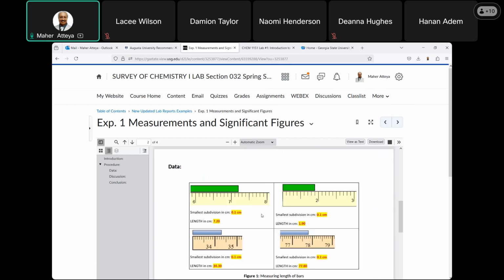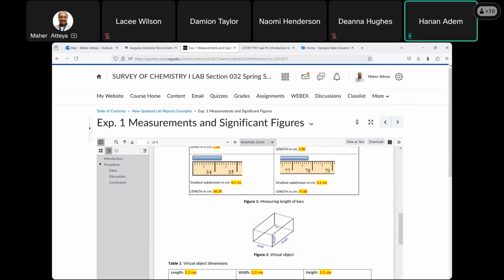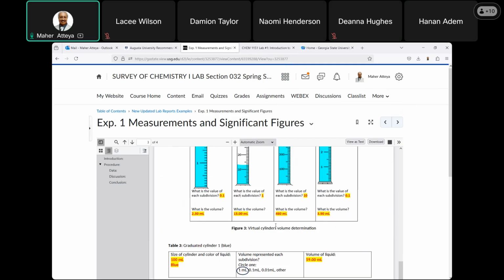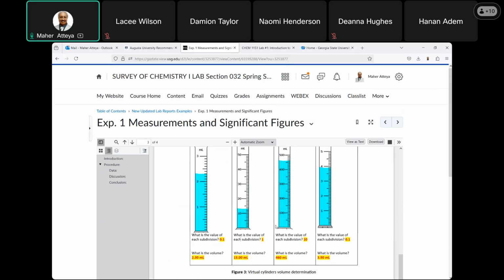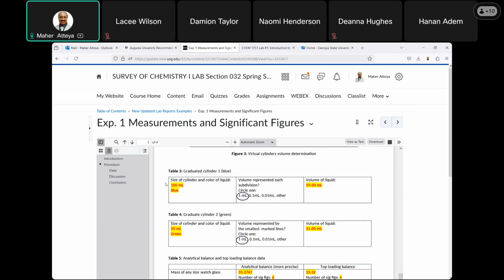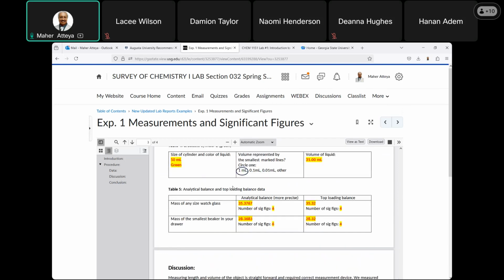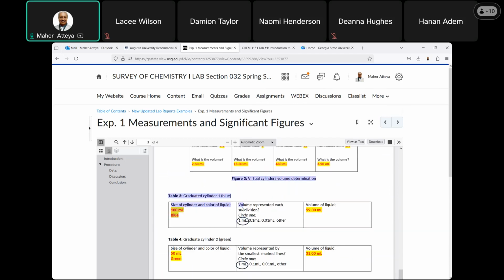This is yes, correct? And this is absolutely yes. Now those you copy them here. The mass of the beaker and mass of the watch glass using both, which is here. This one is not. This volume here is not.